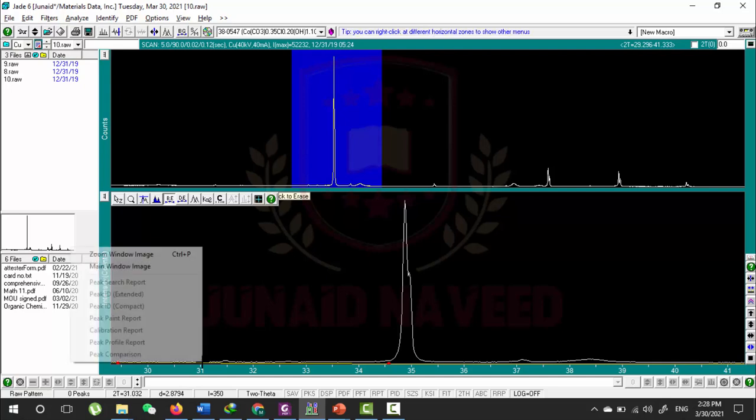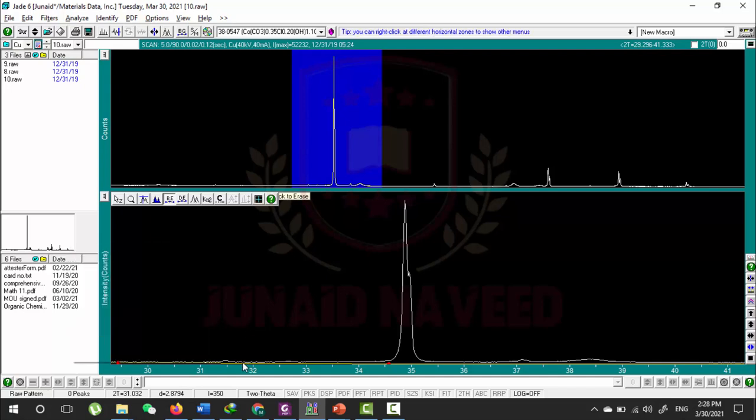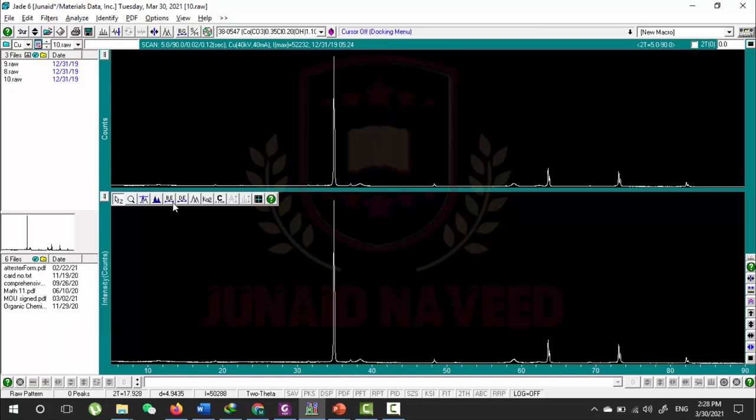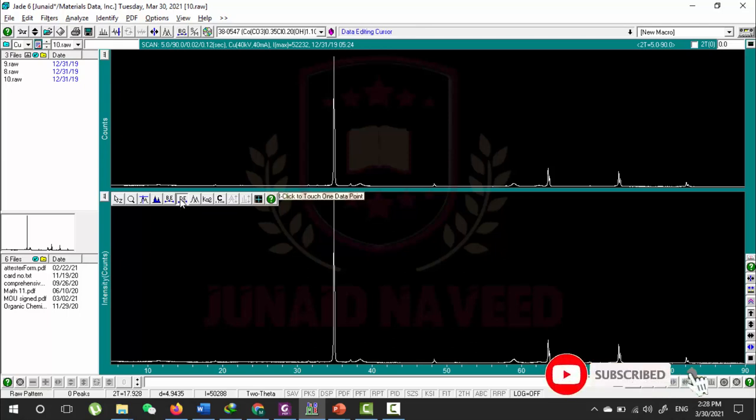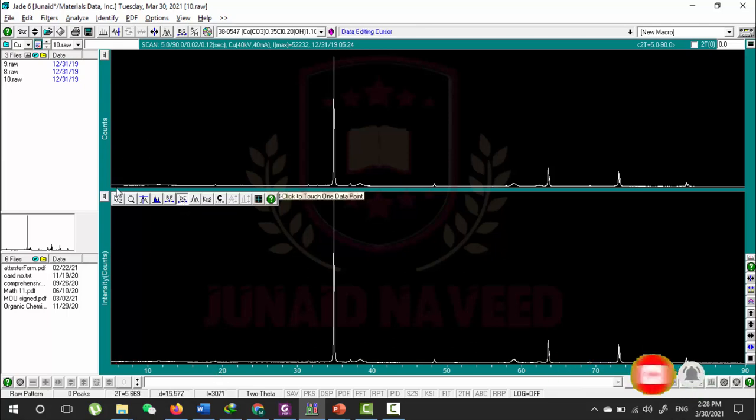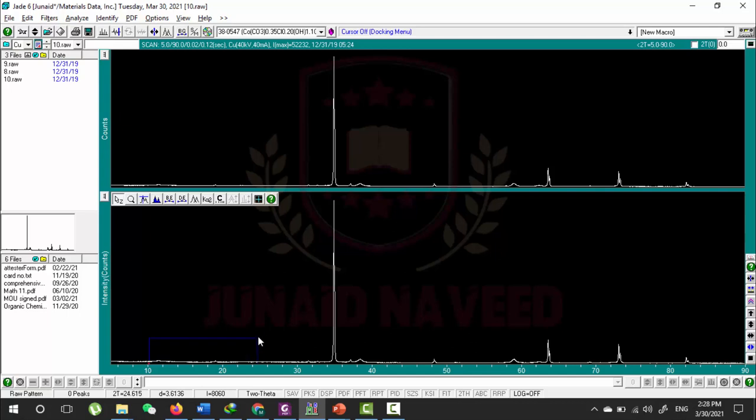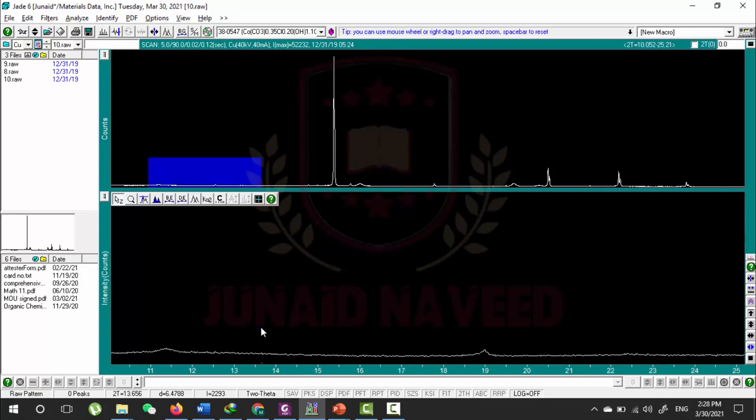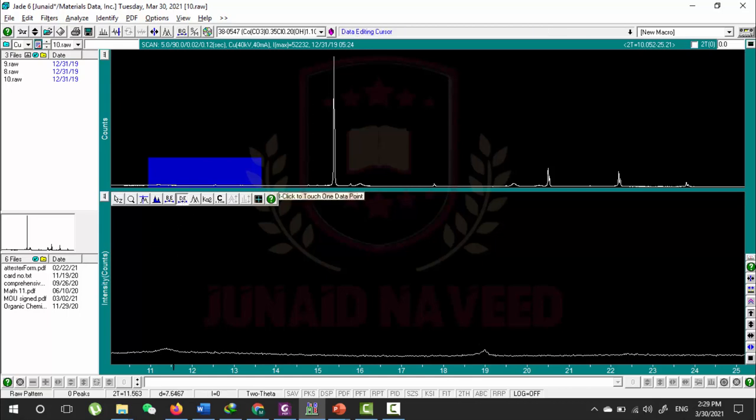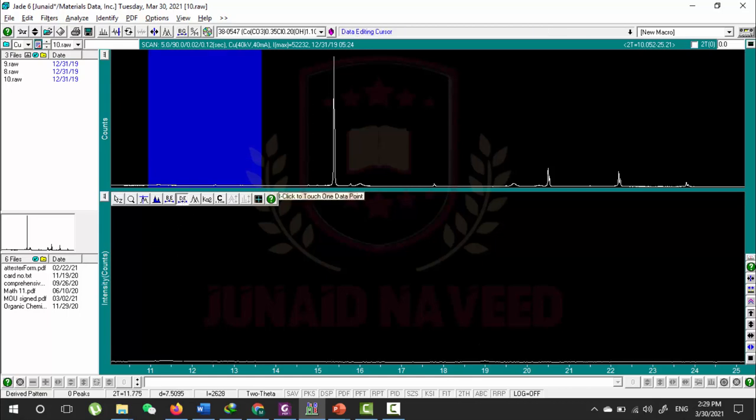Let me remove this. The other is Data Editing Cursor. Now you can change the data points. Let me zoom first. You can see this is our zoomed area.